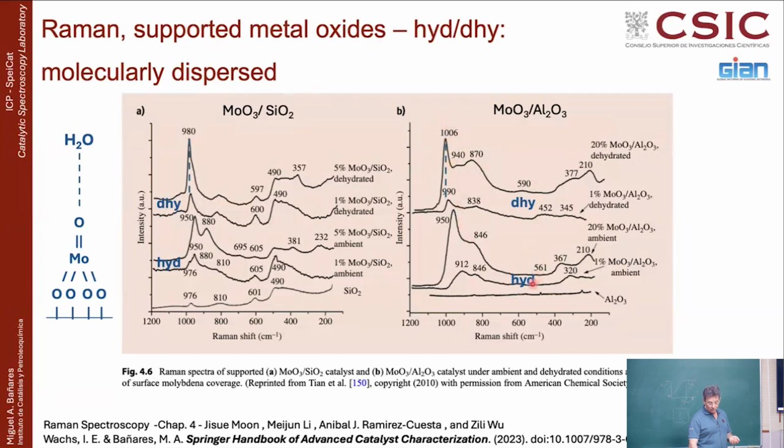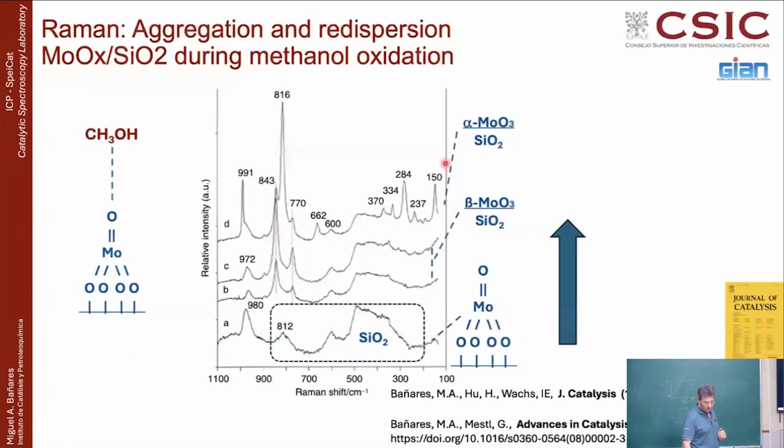Or sometimes it was ambient conditions, but the spectrum didn't look like this, but like that, because they were using a very, very powerful laser power. With a very high concentrated laser power, the sample was very, very hot, so all the water was removed. People didn't know about those things. And because things look relatively similar, people didn't realize that things were exactly different and how important the moisture is.